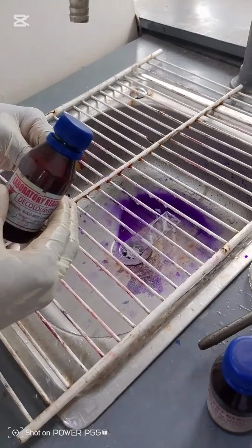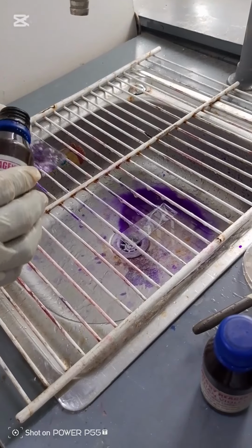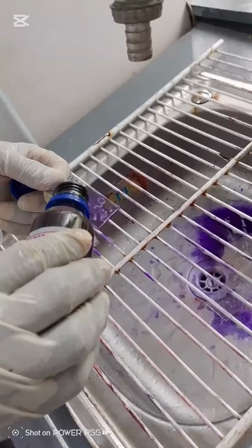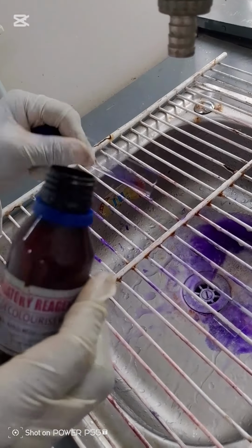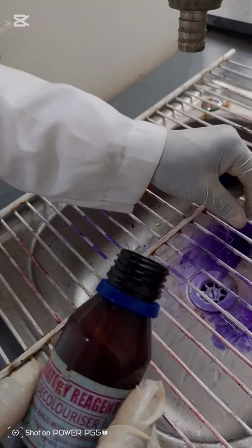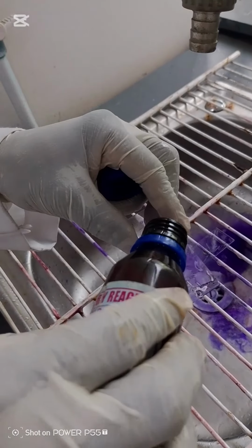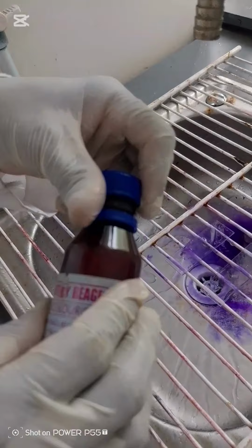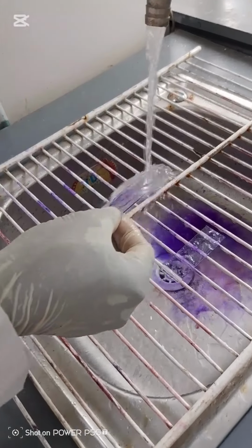You add the decolorizer for a few seconds. Now, if it's a gram-positive bacteria, the decolorizer will not be able to remove the primary stain, so it will retain the primary stain. But if it's a gram-negative bacteria, the decolorizer will remove the primary stain, so it will be colorless and it will now pick the secondary stain. Now, after adding the decolorizer, you rinse with water.